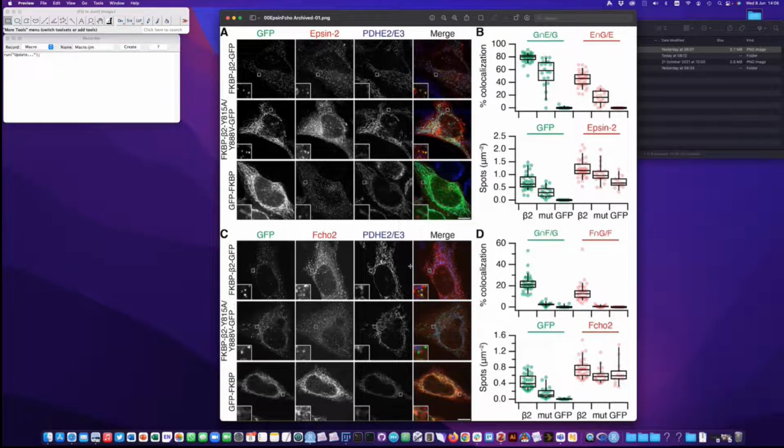And that's important because in Illustrator you could put these in as individual things, and you could even try and make your own ROI zooms in Illustrator. But the problem with that is that it can quickly get out of hand and you can start to make mistakes. And there's nothing more embarrassing than having a figure that's wrong, if you've published it. So the aim of this is to get it reproducible and minimize the number of mistakes that can occur, because it is quite complicated putting these things together.